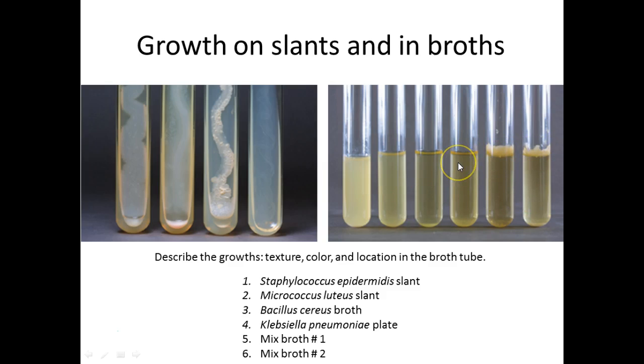They're probably aerobic, and if the culture isn't shaken or stirred throughout incubation, then this is the only place they're going to get oxygen, so they're going to stay at the top of that tube. So we had a couple, and there's a test we'll do later too, that do that. They're strict aerobes. They're going to stay right at the top where the oxygen is. We don't use broth very often because of that problem, that oxygen doesn't diffuse real well through it. So especially aerobic organisms, they're not going to be really happy because they're kind of stuck up at the top.